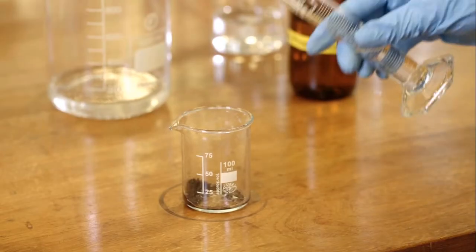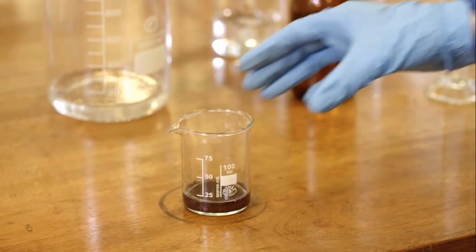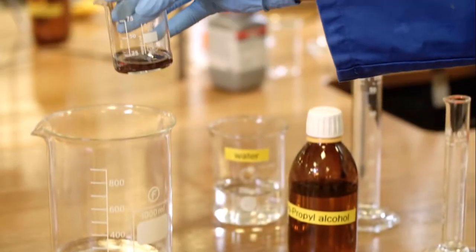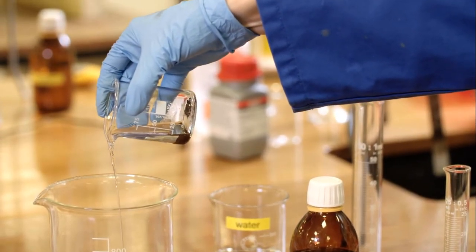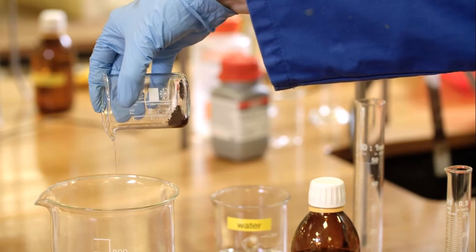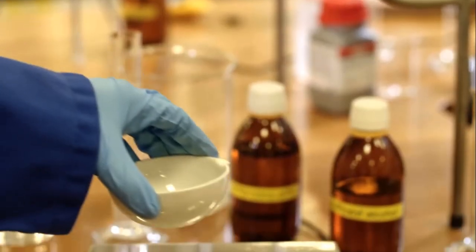Next, the copper is rinsed with 10 centimeters cubed of propan-2-ol. This is repeated 2 more times. Next, an evaporating dish is wiped clean and its mass is recorded.